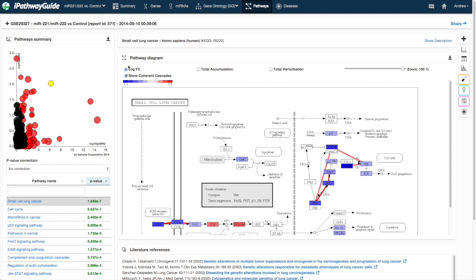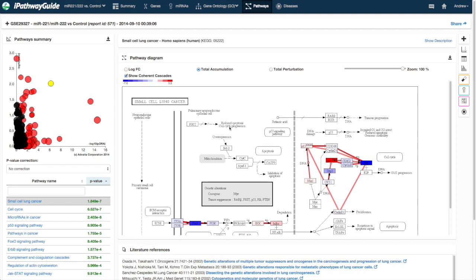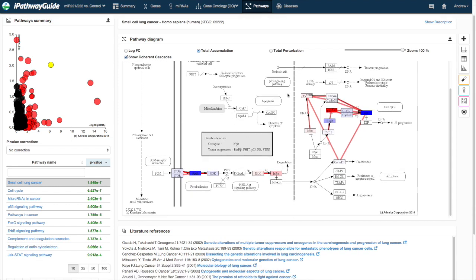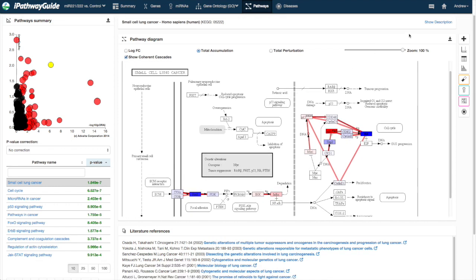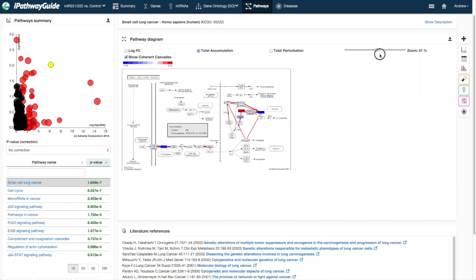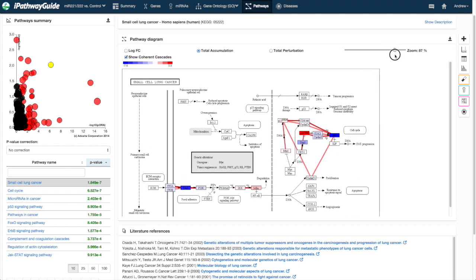iPathway Guide calculates the accumulated perturbation by propagating downstream the measured expression change for each differentially expressed gene through a system of equations that take into account the type, function, position, and interactions for each gene on the pathway.